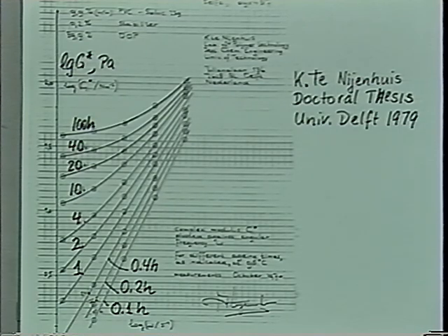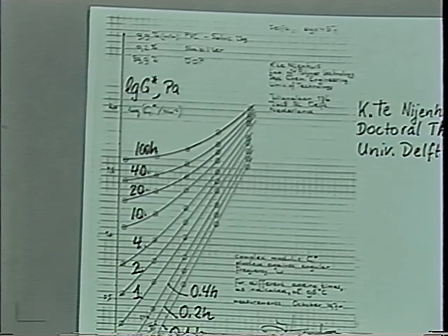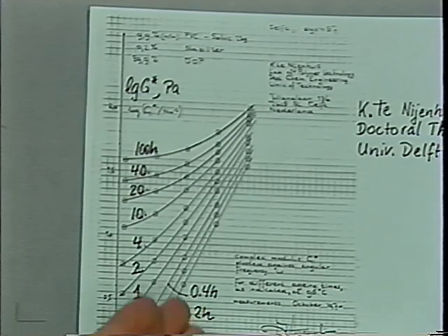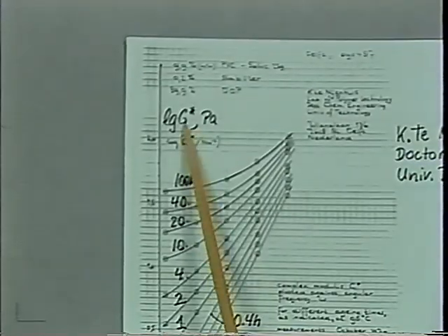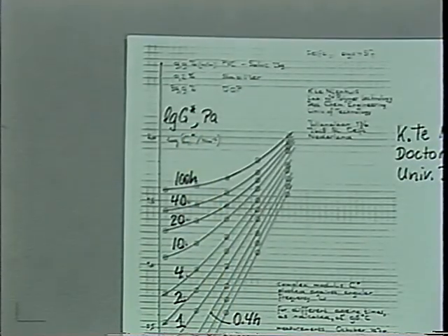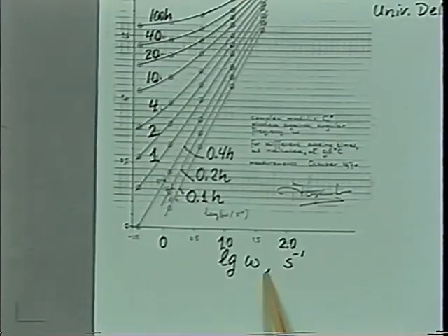That's what you should do when you do your experiments. You keep your data, so if anybody walks up to you in a meeting and says, how about your data 10 years ago? So how did this go? And he had those data available immediately and sent them to me. And I want to see whether these data follow the same evolution as we were used to see in chemically cross-linking systems. He had data of G star, also had data of G prime, G double prime, but let me pull out his original sheet on G star as a function of frequency.